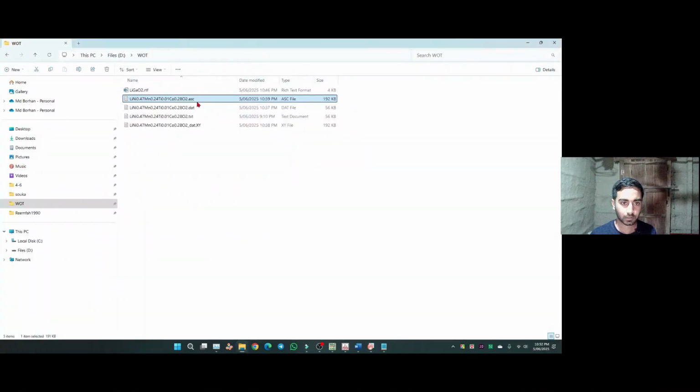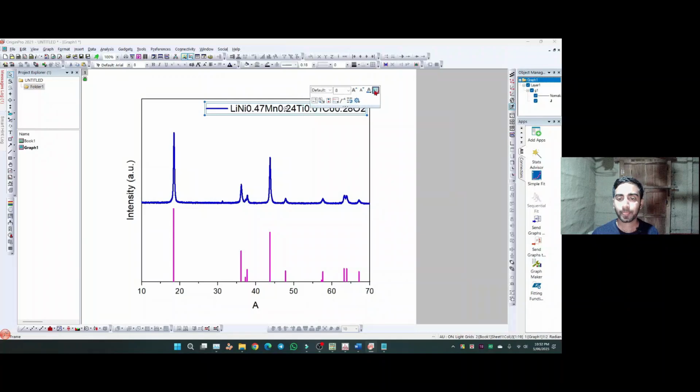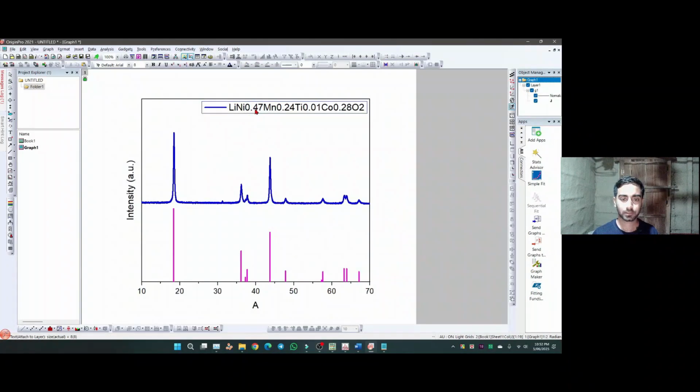And our card name is Control C and put it here, and we don't need it because these are from. Okay, we have to write the subscript and superscript accordingly. Okay, our file is ready.